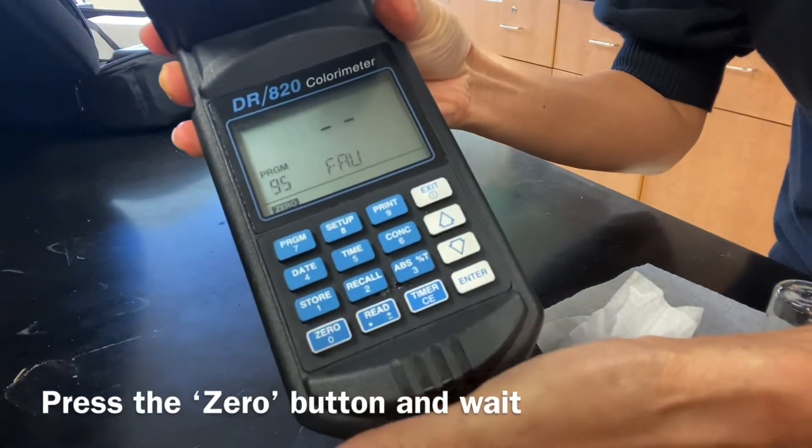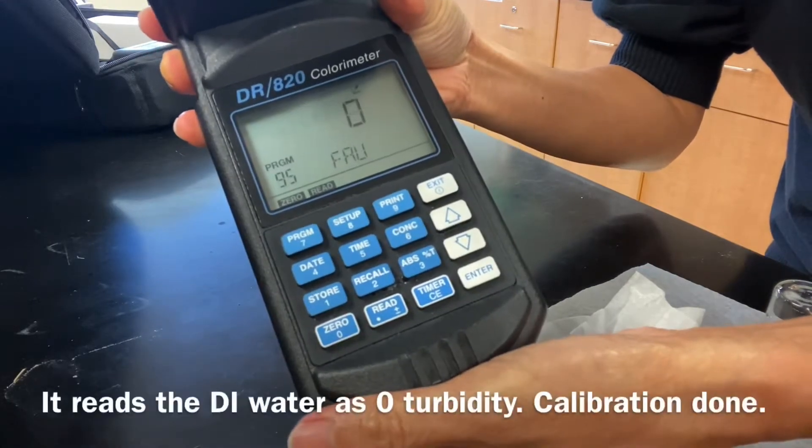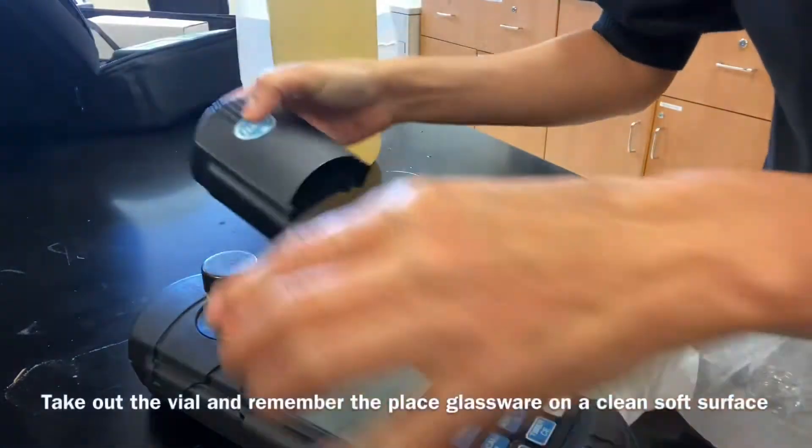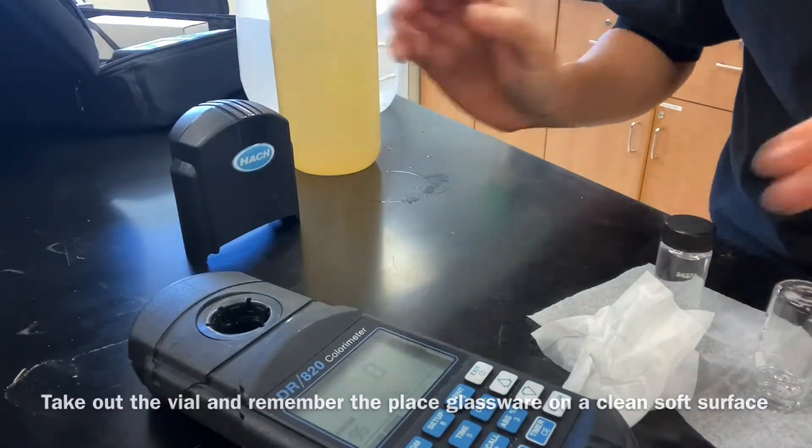According to the U.S. EPA, turbidity is limited up to 1 FAU or 1 NTU for drinking water.